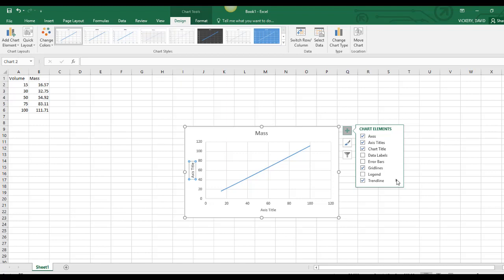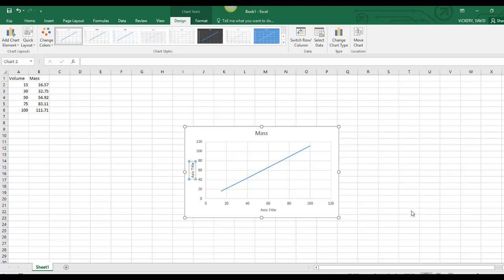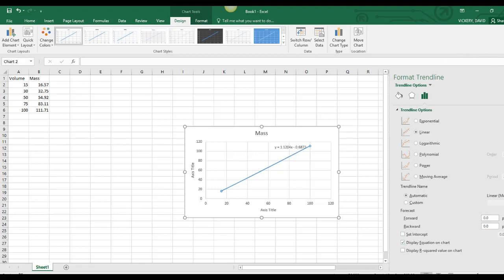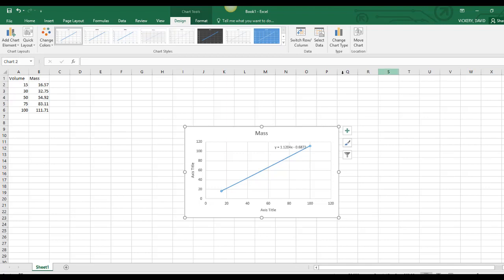If I click the arrow and go to More Options, I want to display equation on the chart. I can go ahead and close this formatting box.